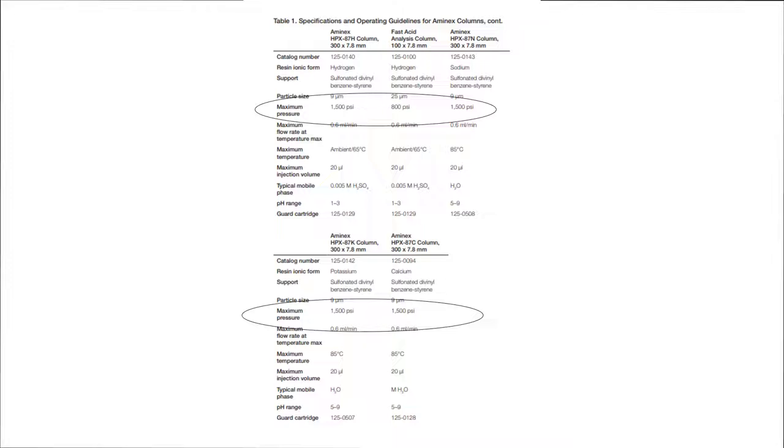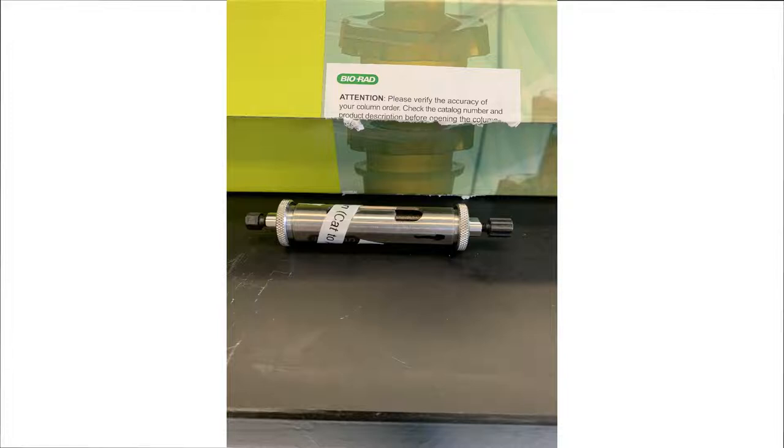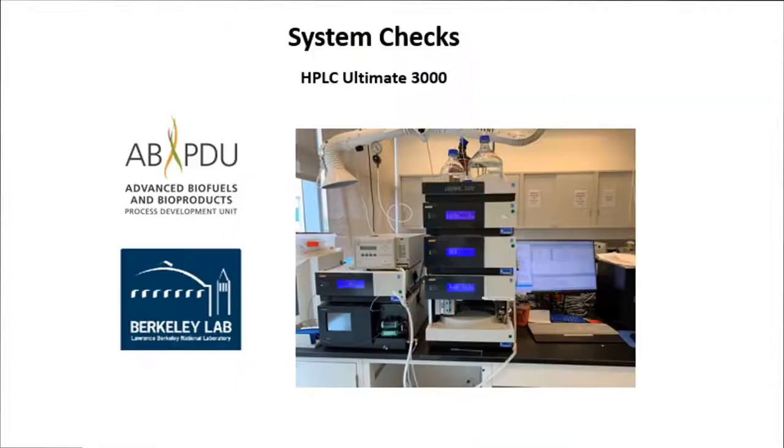Be sure the proper eluent is moving through the column. The operating pressure should stay below the pressure suggested within the product manual. Any time when the pressure is higher than normal during equilibration, consult the analytical team or column vendor for solutions. Guard columns are protective cartridges installed before the analytical columns. They serve to remove the impurities and suspended solids from reaching the analytical columns.